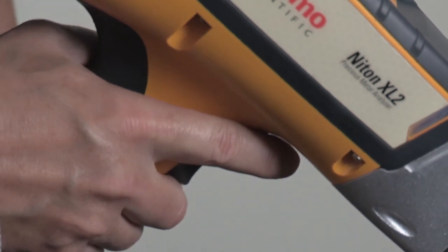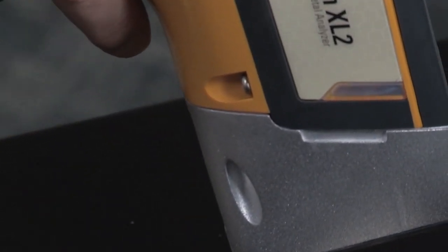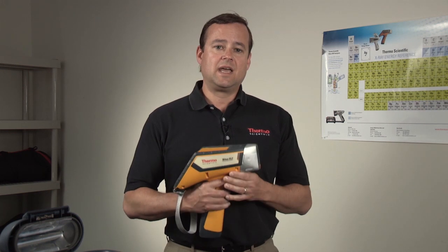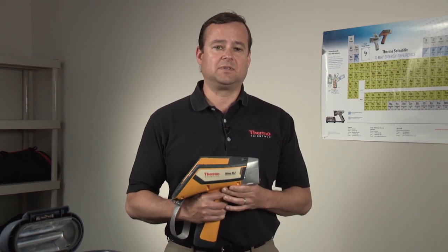This piece of equipment is fundamentally changing the way people do business in the world of precious metals in regard to buying jewelry, coins, and other precious metal items. It will give you a fast, simple, and most importantly accurate analysis of precious metal content in all items that you're considering buying or selling.